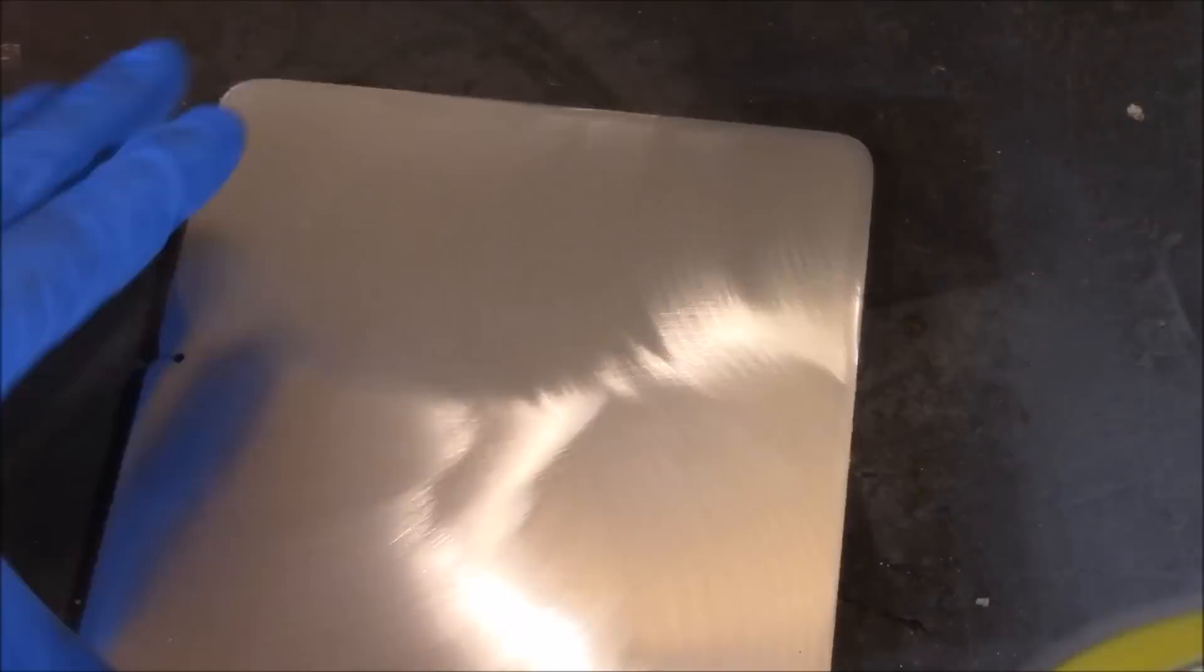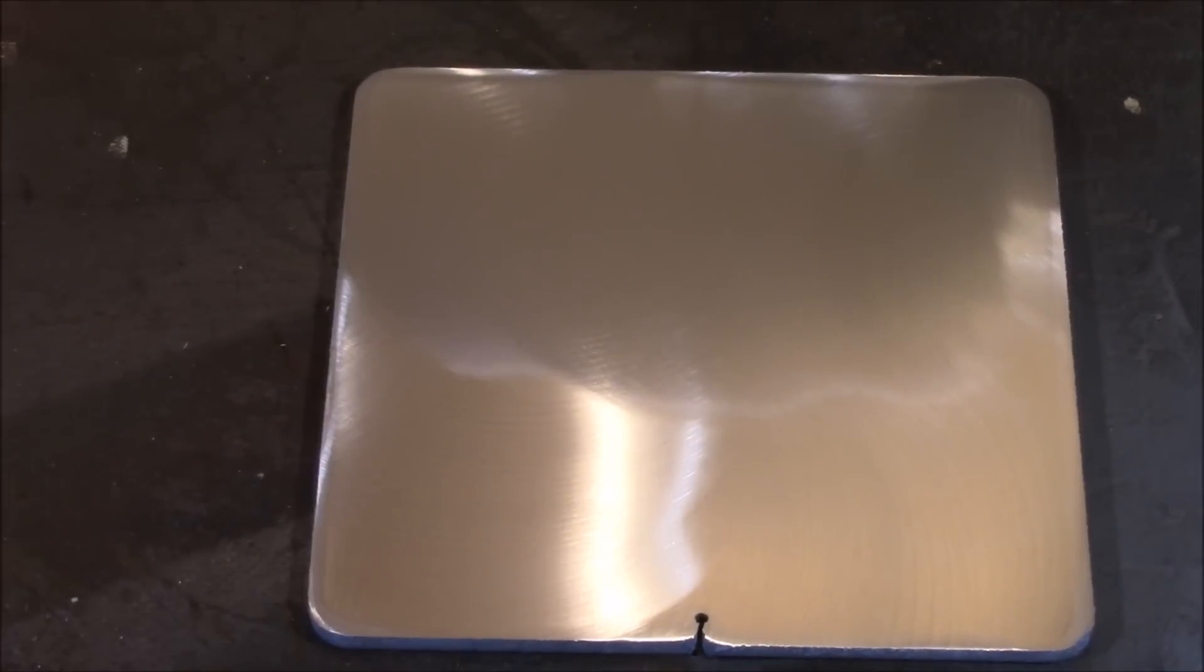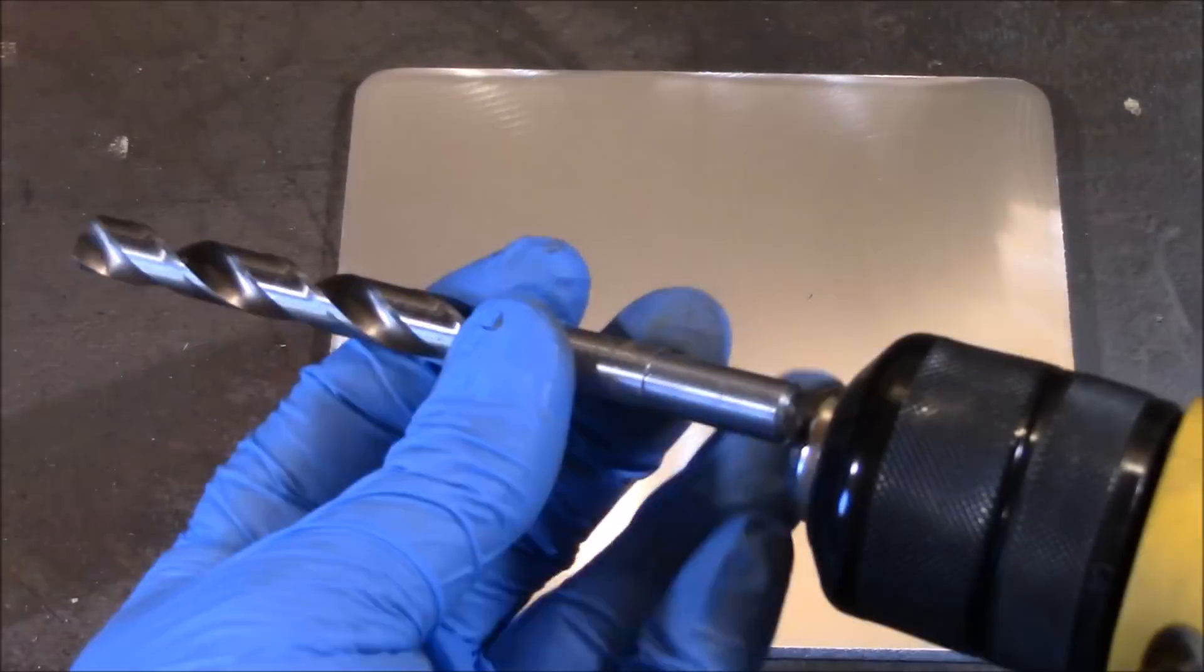Under normal conditions, aluminum is surrounded by a protective oxide layer. Metallic mercury isn't able to penetrate this barrier.